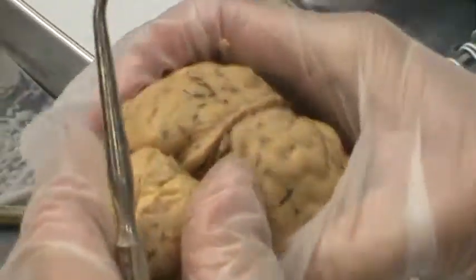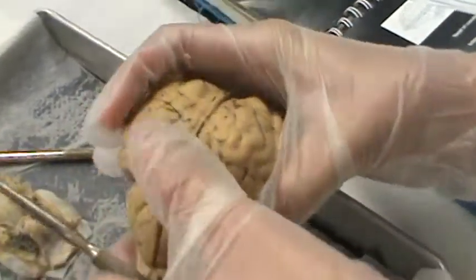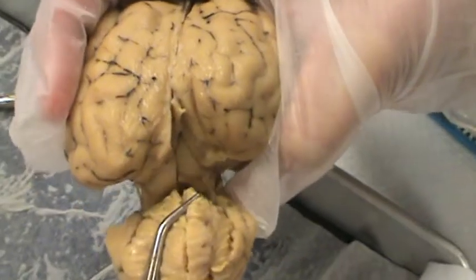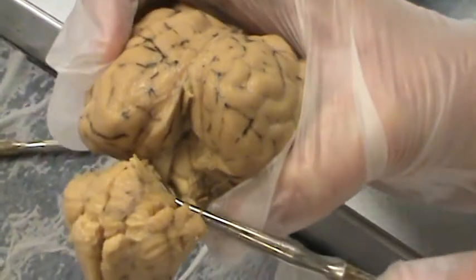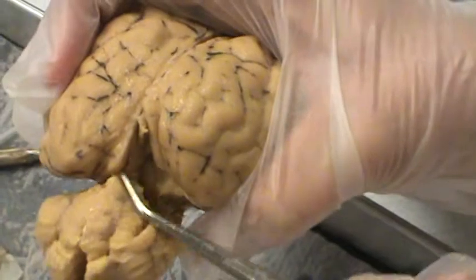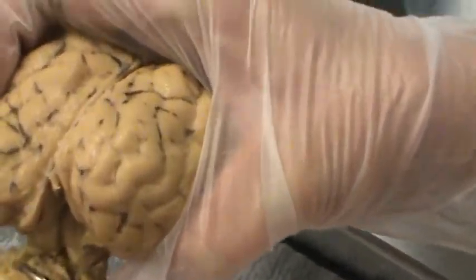The corpora quadrigemina is this. It kind of looks like a baby's butt. And the superior one on top is the superior colliculi, and the one below is the inferior colliculi.